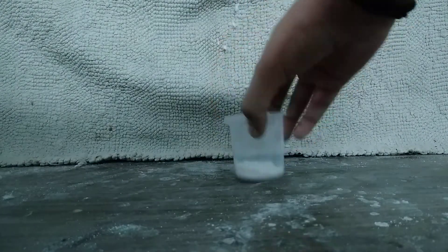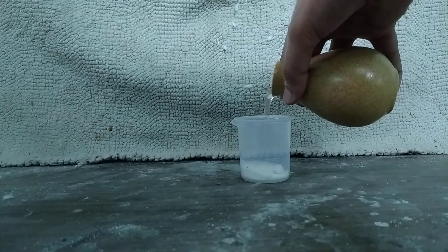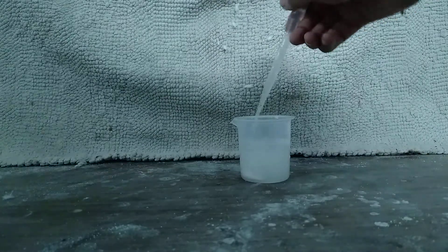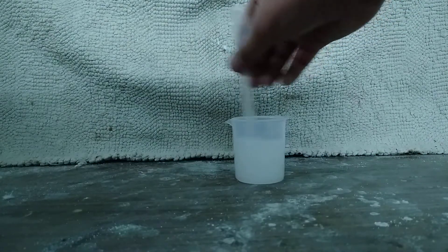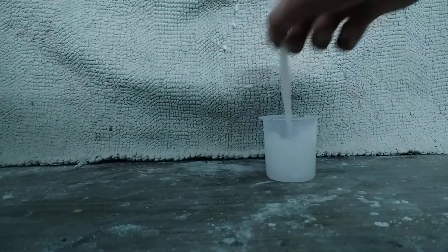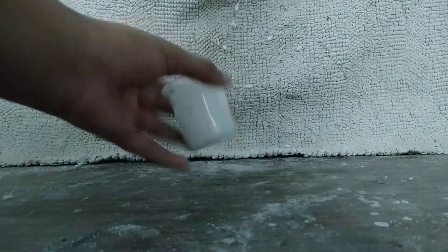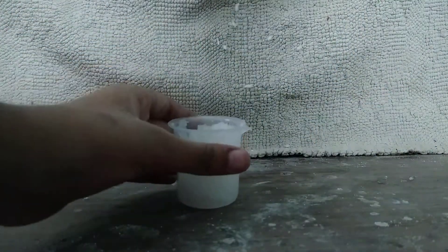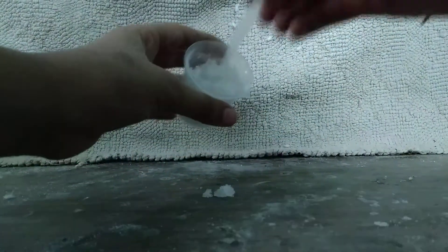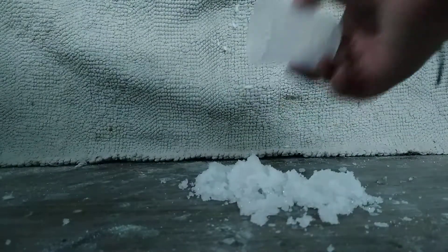Look, the water literally just vanished. Now I will add a lot of water in at once and let's see what happens. It's very fluffy powder sort of thing. It looks like snow, and that is why it is sold as fake snow in the market also.